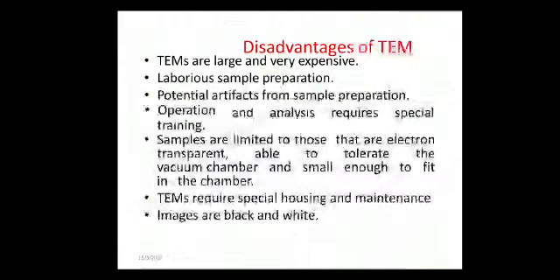Applications: transmission electron microscopes are used in the field of life science, medical field, biological fields, metal research, as well as forensic analysis. TEM provides topological, morphological, compositional and crystalline information to study crystals and metals, to identify flaws, fractures and damages, and to view samples on a molecular level. It is also used in semiconductor analysis and the manufacturing of computer and silicon chips.